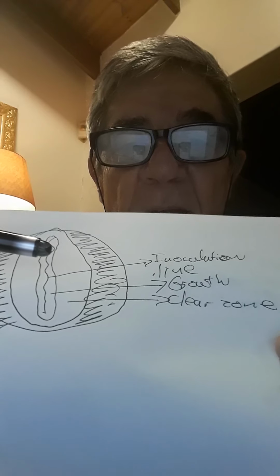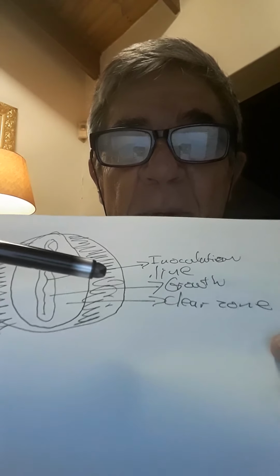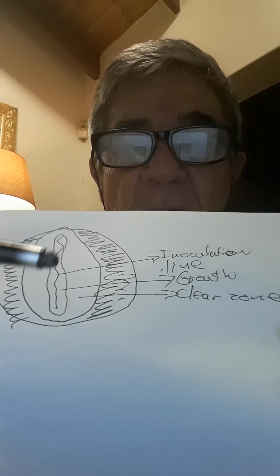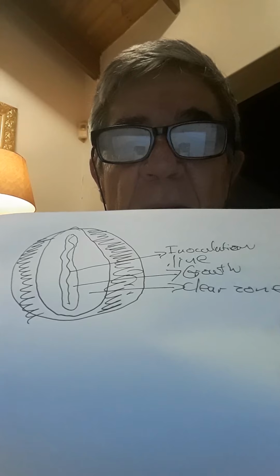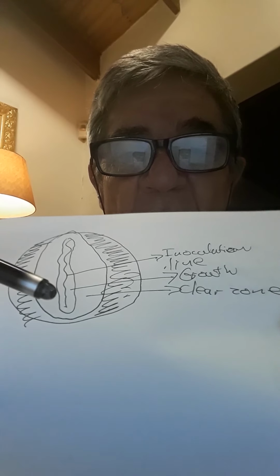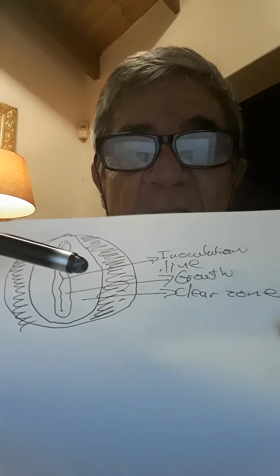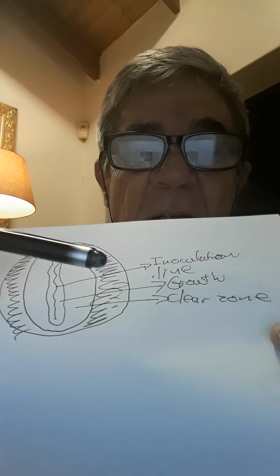Then after that, we flood. What is coloring starch blue? It is gram iodine. So we flood the whole plate with gram iodine. In the case where the enzyme is being excreted into the environment, we will find a clear zone, and the rest of the plate will stain blue.